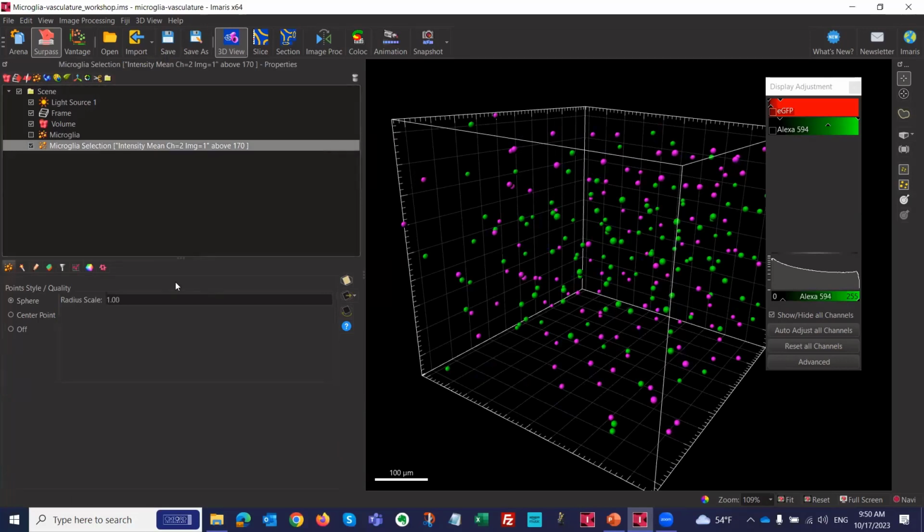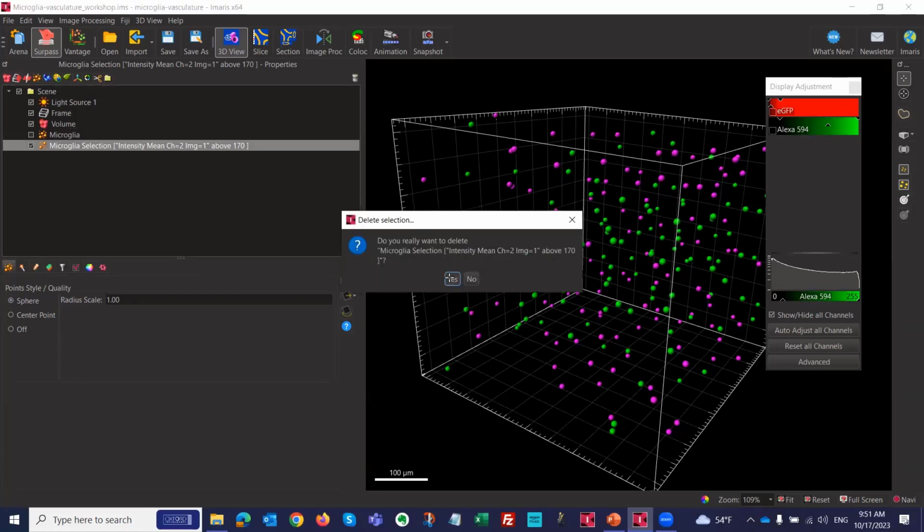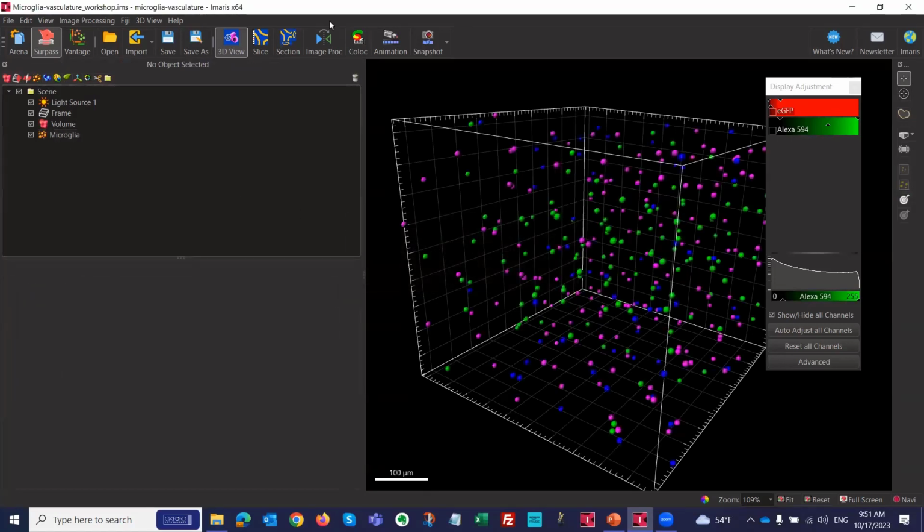Now I can bump this up, and then I can do another microglia, just focusing on the dim ones. And then at the end, I can also merge those two into one new one to maybe try to capture the very dim ones in a separate fashion, yes. So there's a few possibilities to do this, yeah, absolutely. Let me just delete this, guys. Here's the microphone.